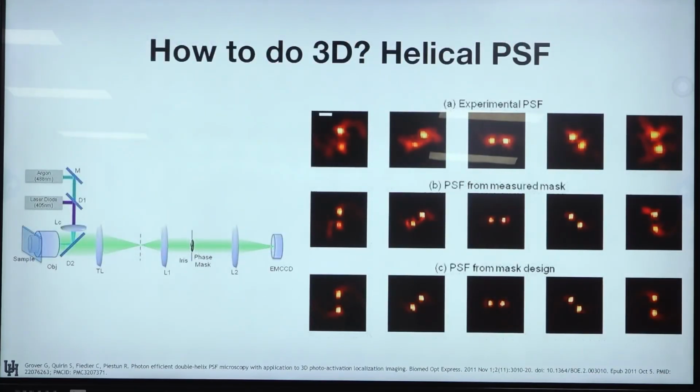So this was 2D, right? Like I was showing an image, you can get very good data in 2D with this kind of approach. And people extended this to 3D. So how do you extend this to 3D? Another person came up with a very clever idea, which was: you have the sample.